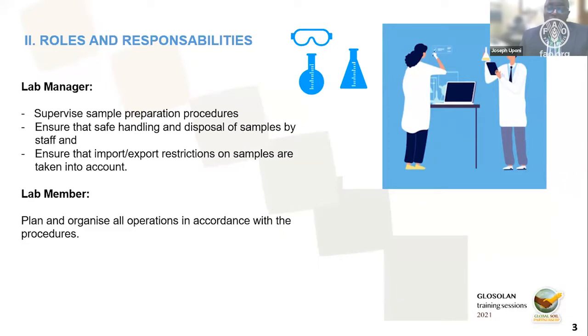And sometimes some samples are special. They may be radiated samples. So the lab manager should have prior knowledge of all such information so that the staff who are handling the samples are adequately prepared to handle them. He should also take responsibility to ensure that import or export restrictions on samples are taken into account. For laboratories that receive samples from different other countries, this is very, very important, so that we're not transferring pathogens from one country to another.